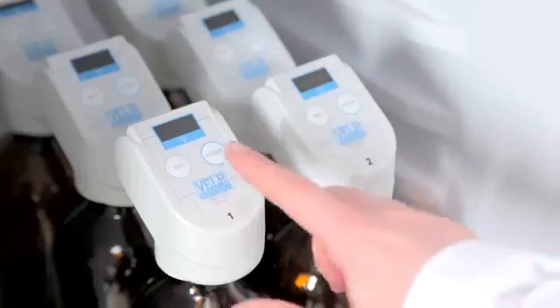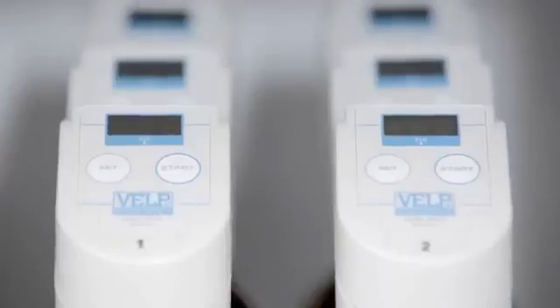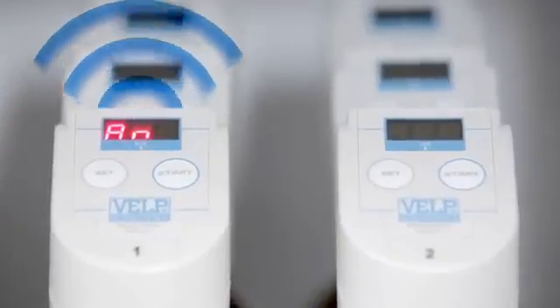The extremely compact stirring station ensures constant stirring, remaining cold even after continuous use.